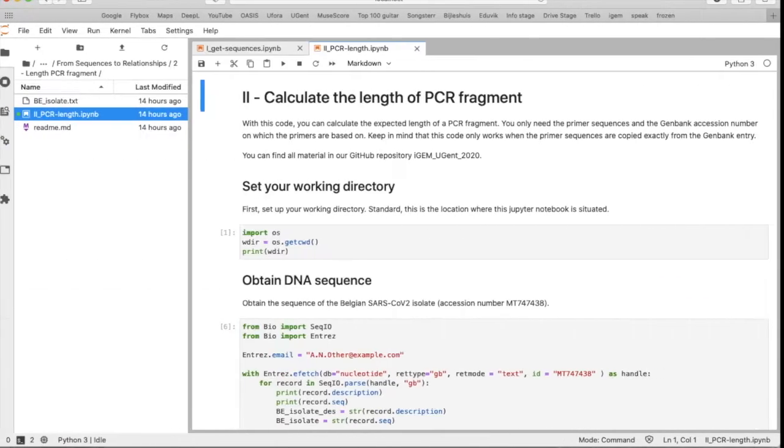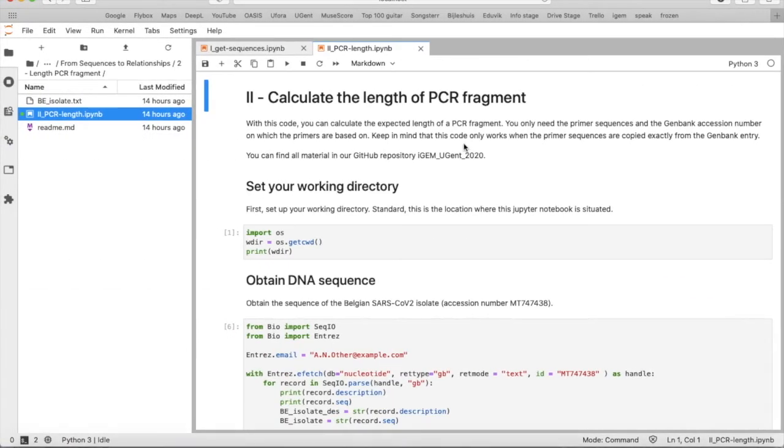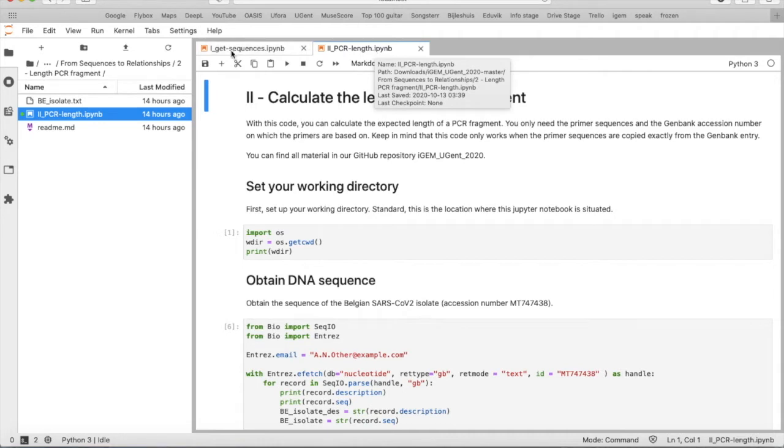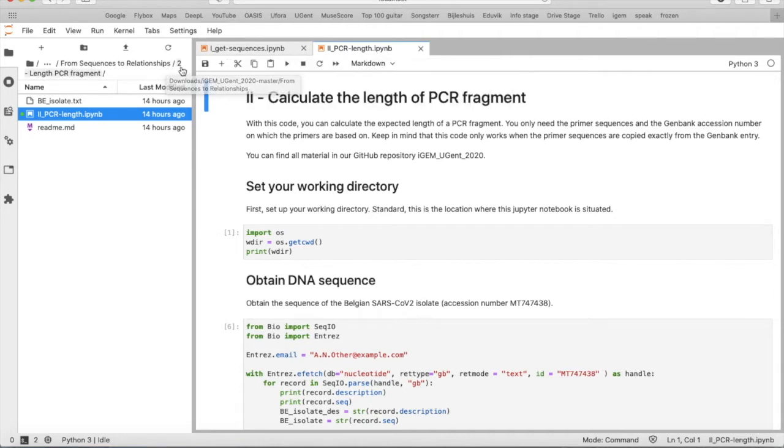So let's have a look at our Jupyter notebook. So it's number 2, PCR length, that is situated in the second folder, the folder 2 length PCR fragment.